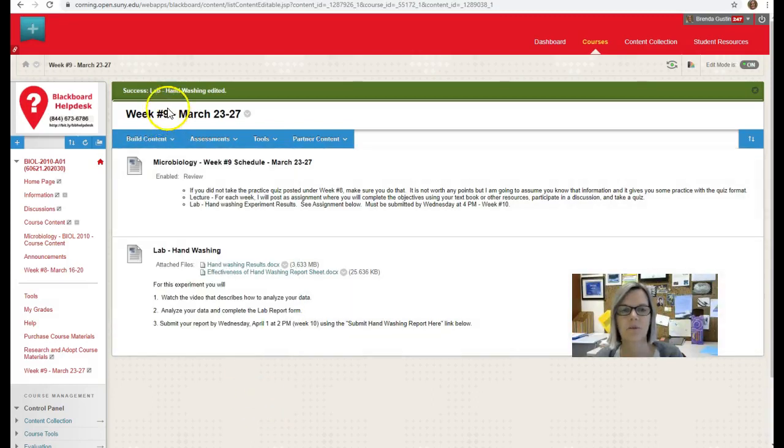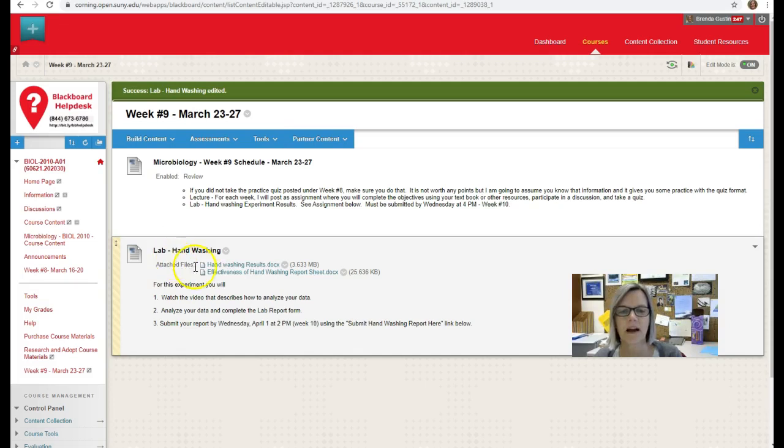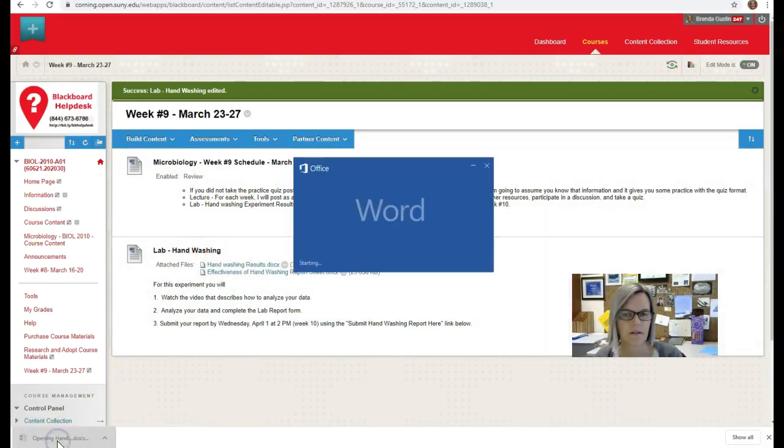Hi everybody, I'm on our week 9 Blackboard page and I'm going to go over the hand washing lab. First thing you want to do is go to the hand washing results link right here. I'm going to click on that and open that up.